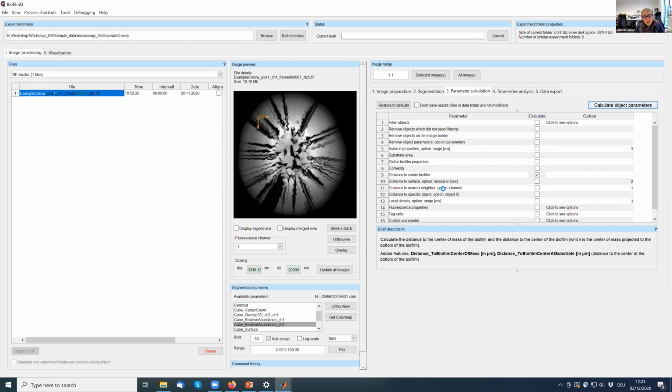So again, the reason why this is taking a moment is because we have so many cells. And this is why I suggested for people who are following along and might not have a powerful computer to use the 2D version. The 2D version is faster because it only has one slice. And we just saw before that the slices are actually extended to 30 instead of 5. So this would be like 30 times faster. I guess maybe I should have done this too, but I wanted to show you a 3-dimensional example.